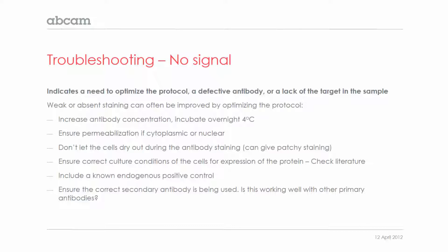Remember to permeabilise if it's a cytoplasmic or nuclear protein. Don't let the cells dry out during the antibody staining — this can give patchy staining, where some areas might have no staining whereas others have too much. Make sure you've had the correct culture conditions for expression of the protein, and check the literature for this. It's always good to include a known endogenous positive control, which will indicate if your procedure is working well. Ensure the correct secondary antibody is being used, and check that it's working well with other primary antibodies.